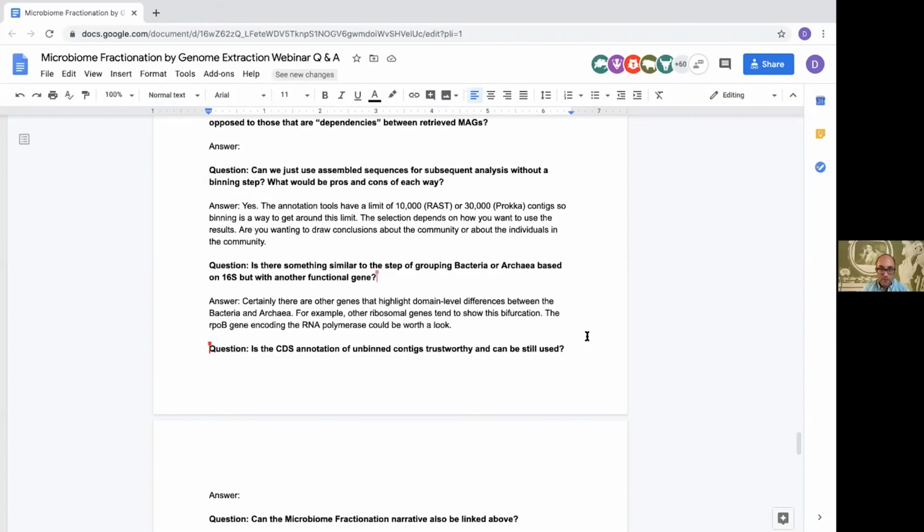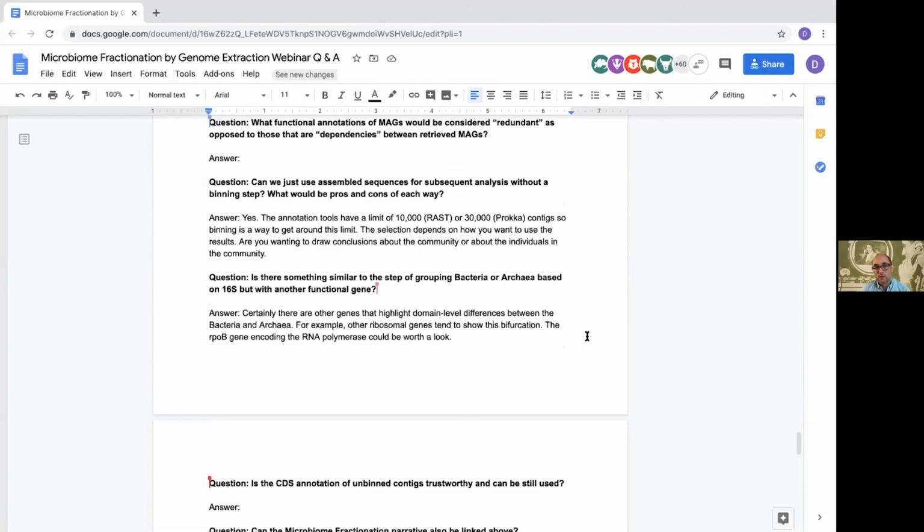And they're typically on the order of 50-ish universals, depending on how you defined it. And then there's on the order of 100 if it's just bacteria. And then as you go down, it depends on your phylum. So that is the approach taken. It's tree building, multiple sequence alignment, and trimming to conserved regions of those multiple alignments and so on. However, if you wanted to use just a single marker gene family or a limited number of them instead of using the full collection of phylogenetic markers, you could certainly do that.